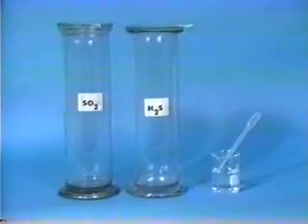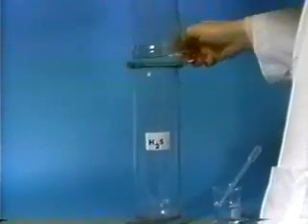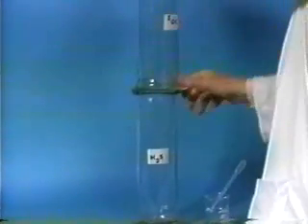In this experiment, we are going to demonstrate an important industrial reaction, which is catalyzed by water. First, we invert a jar of colorless SO2 gas over a jar of colorless hydrogen sulfide gas.